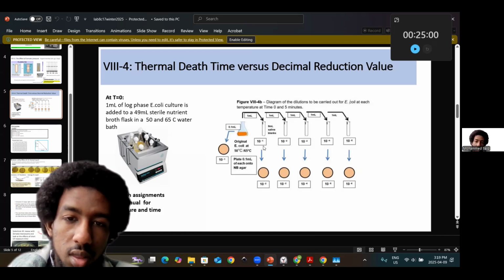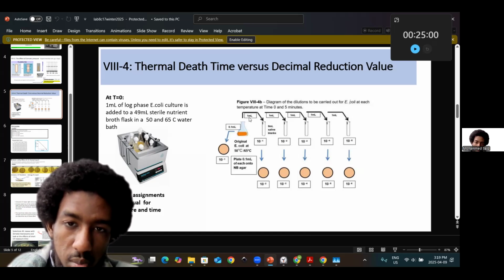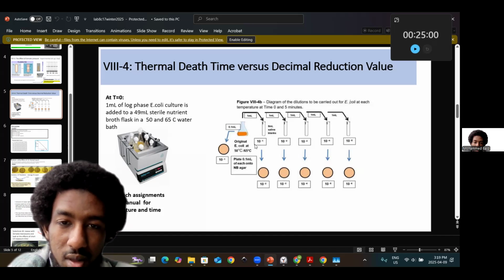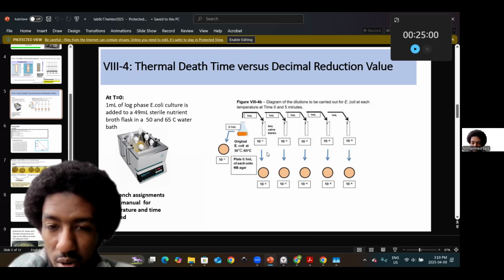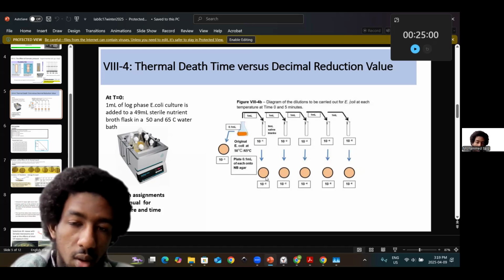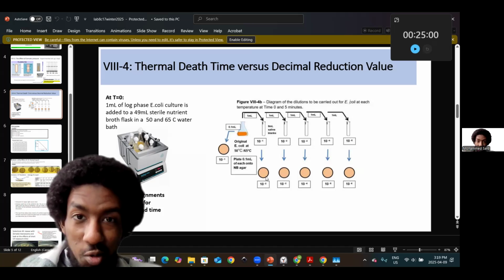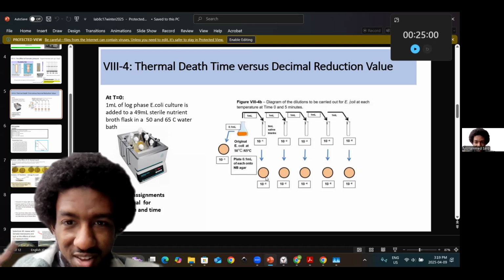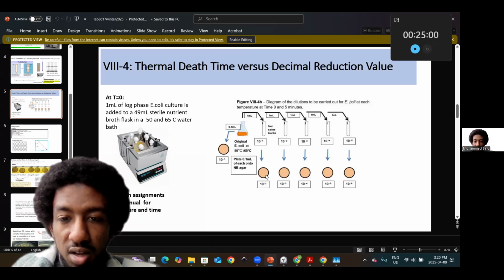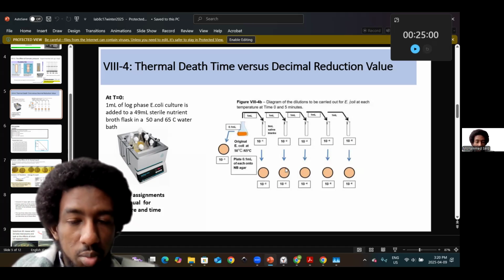And then importantly, you would have taken 0.1 mils, which is attributed to that 1 mil, right? So it's like 0.1 divided by 1, that's 10 times less, or 0.1 essentially. And so you do essentially 10 to the minus 1 times 0.1, and you do that across the board, across the different tubes. So you would have expected a logarithmically lower final dilution factor, consider logarithms an application in this regard, which by the way is appropriate to note.